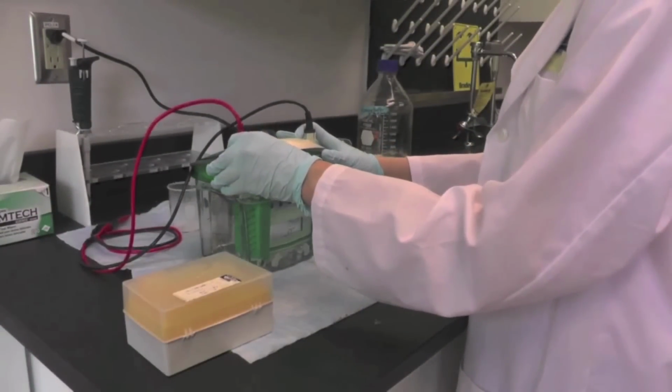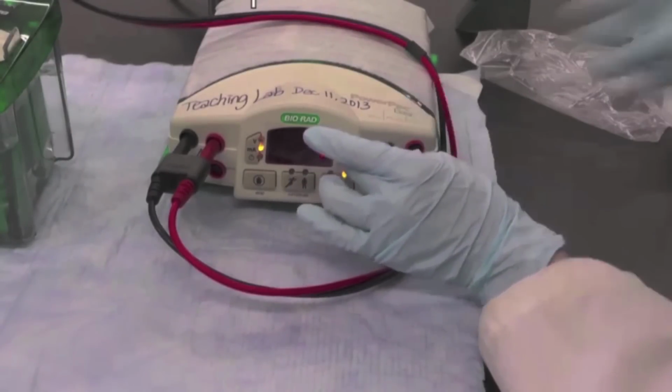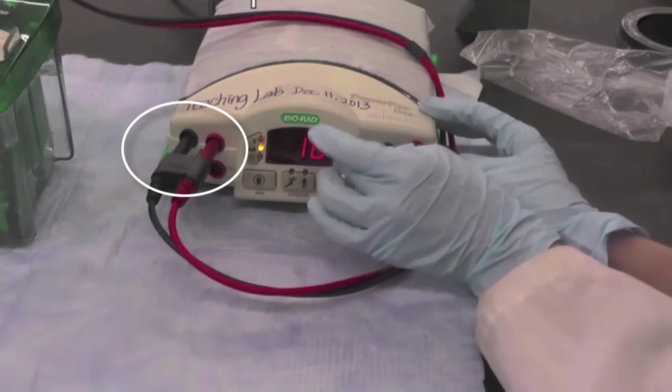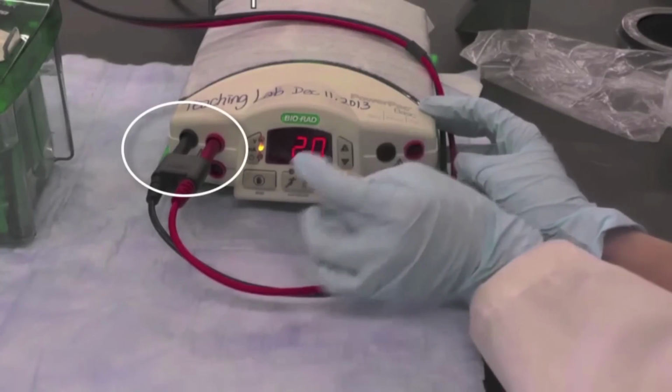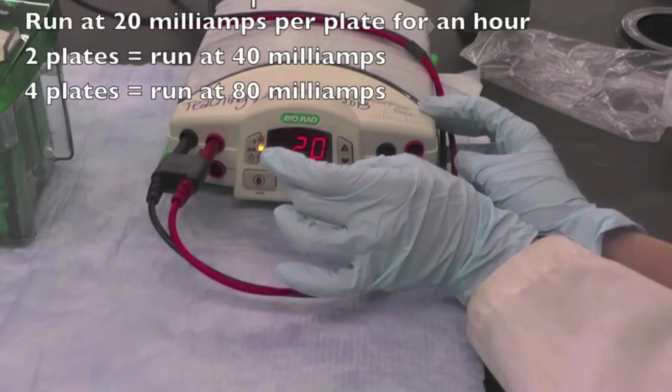When all the samples are loaded, close the lid on the tank and insert the electrodes properly into the power supply. Red wire into the red slot and black into the black slot. Set the power to 20 milliamps per plate and run for 1 hour. For example, if four plates are being run, the power should be set at 80 milliamps.